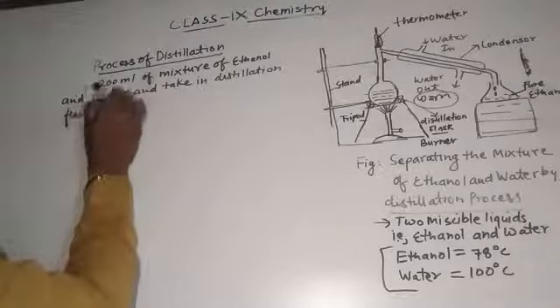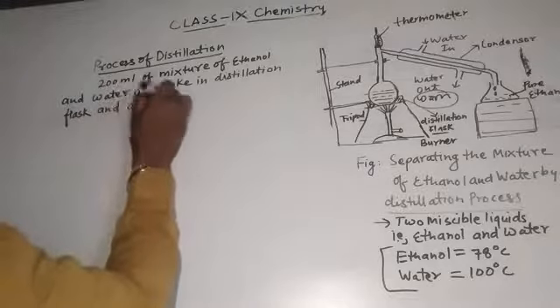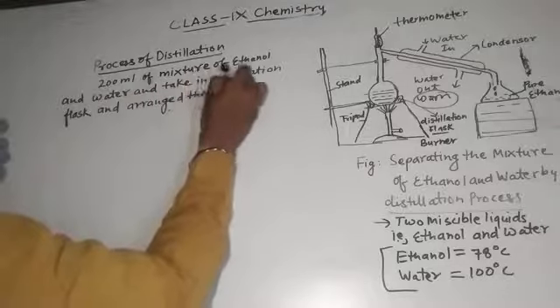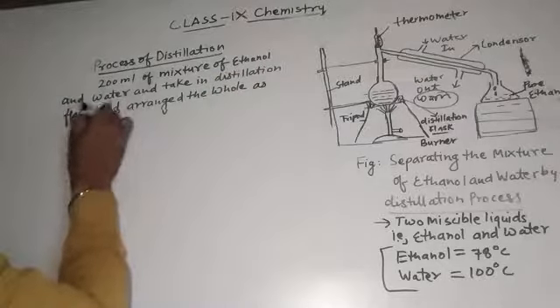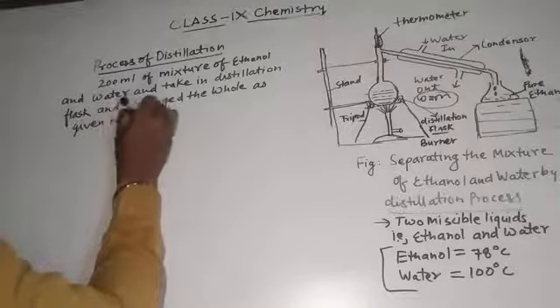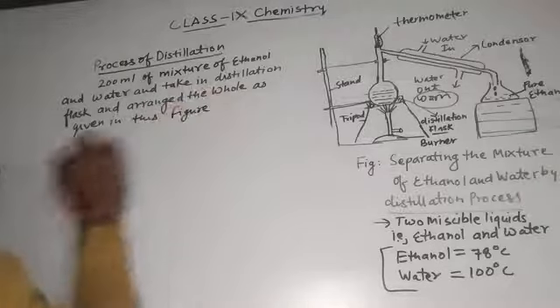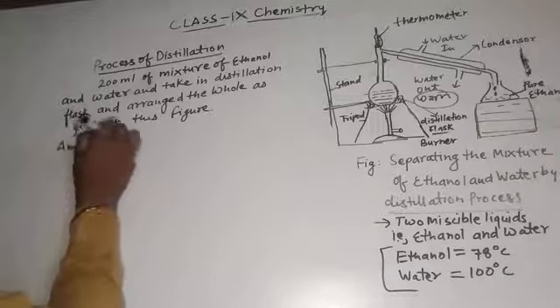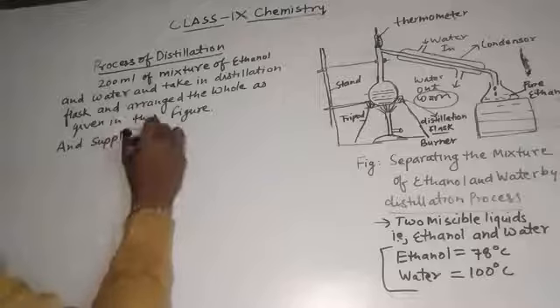And arrange the whole setup as given in the figure, and supply the heat from the burner.